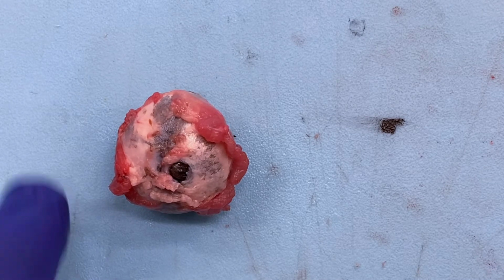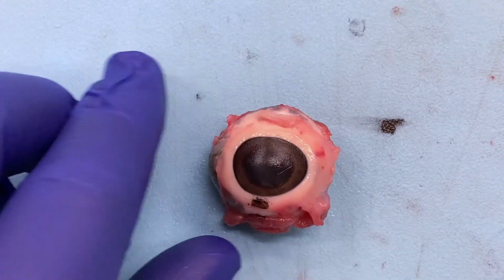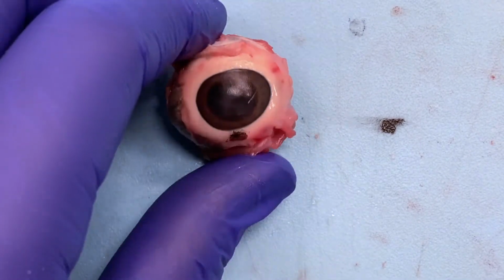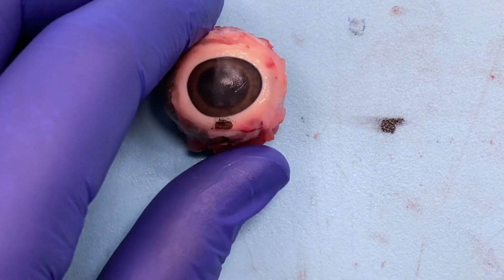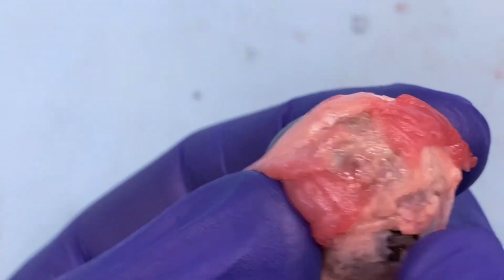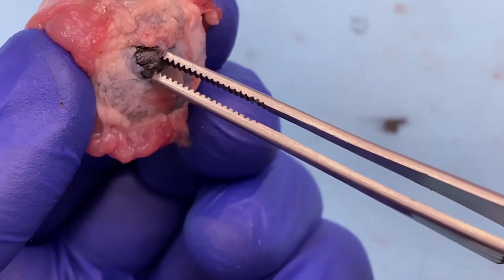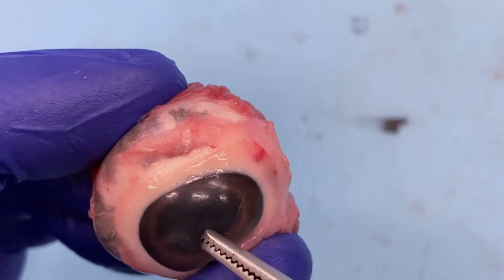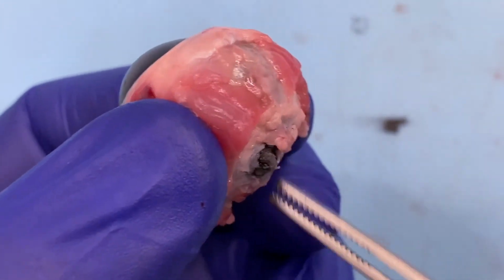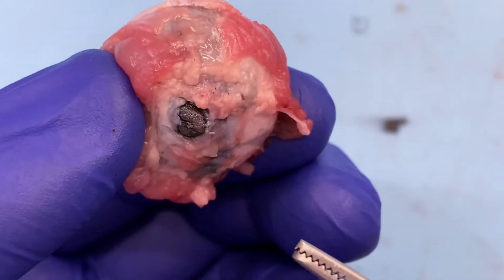All right, next step, we're going to go cut into this eye. Because of the globe shape of this specimen, it means we can kind of rotate it in any direction. And what we're ultimately aiming for is to get this optic nerve in the same plane as this pupil. That's not inherently hard to do because they're relatively directly behind each other.